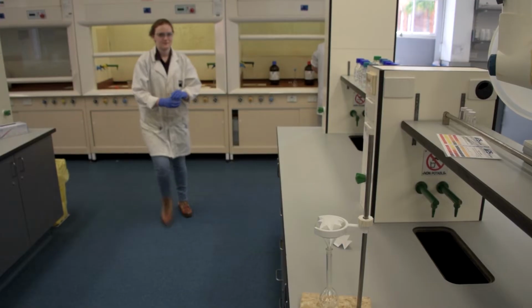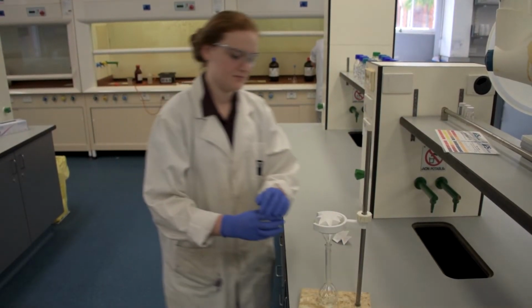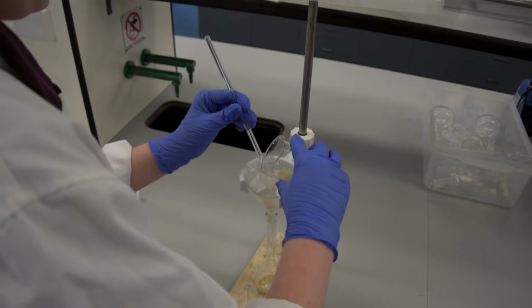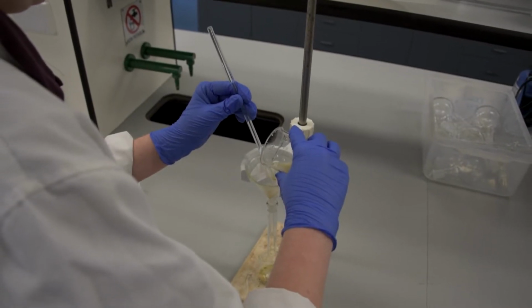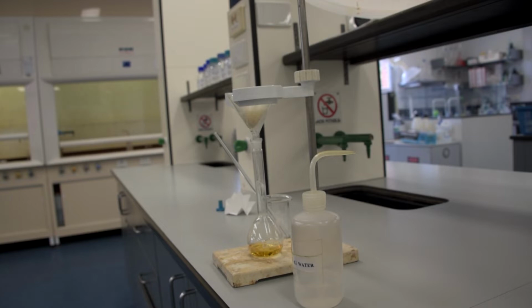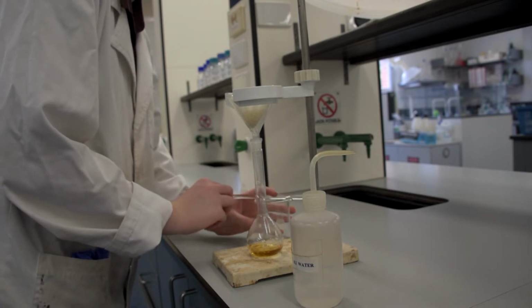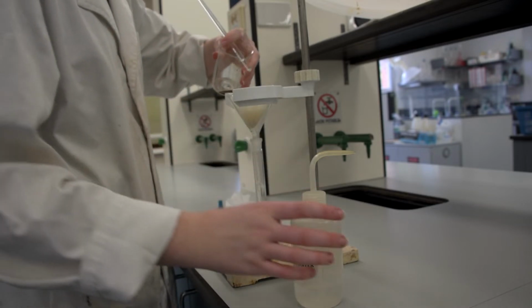After the acid and the sediment had cooled, it was filtered through the prepared filter apparatus. A stirring rod was used to guide the flow from the beaker into the filter. Once all the solution was in the funnel, the solution was quantitatively washed into the funnel.